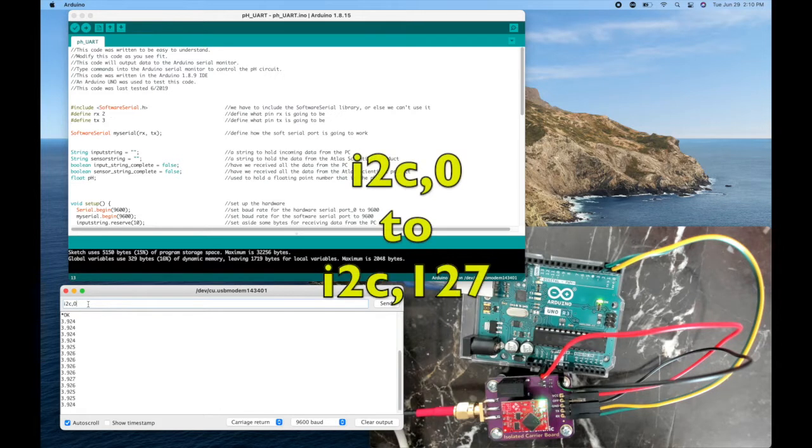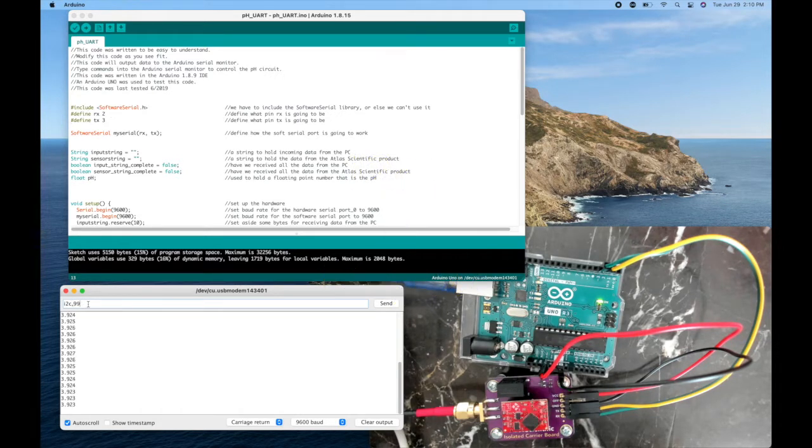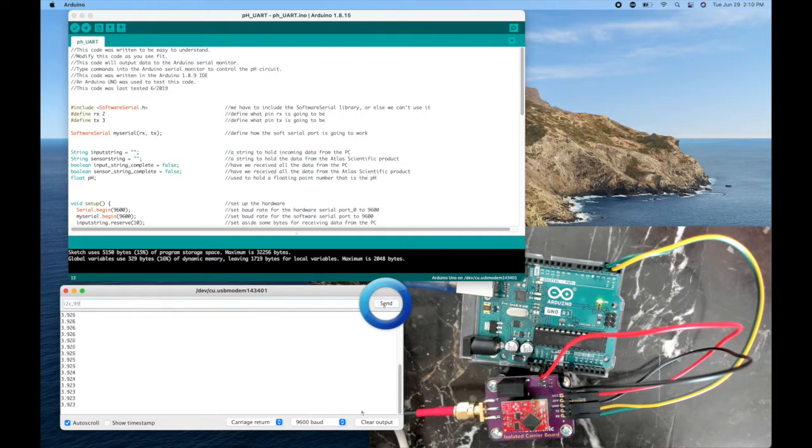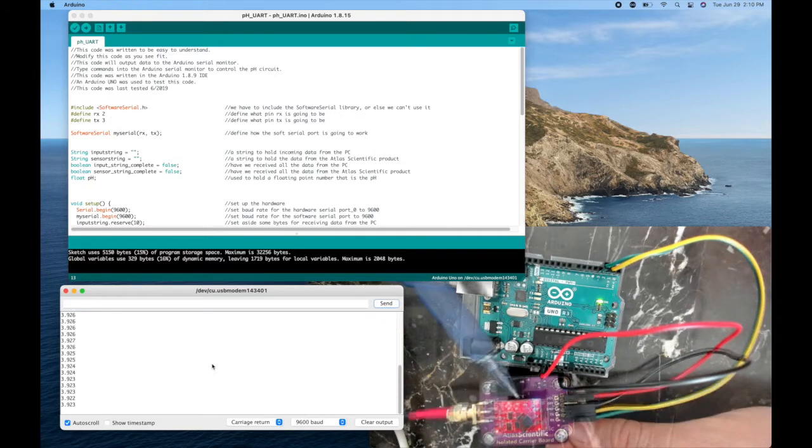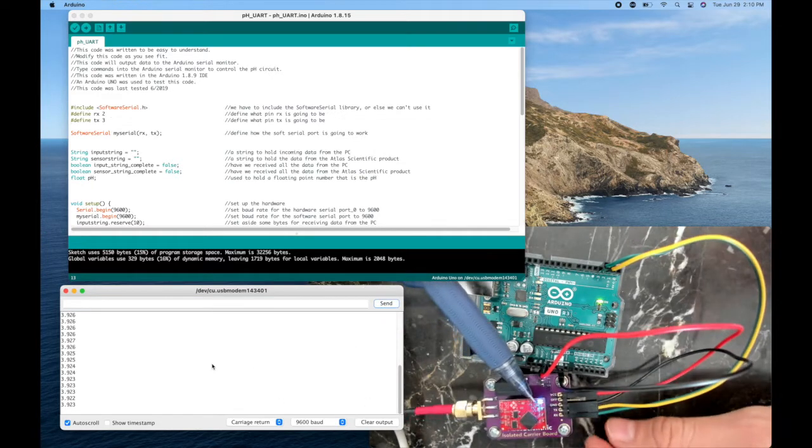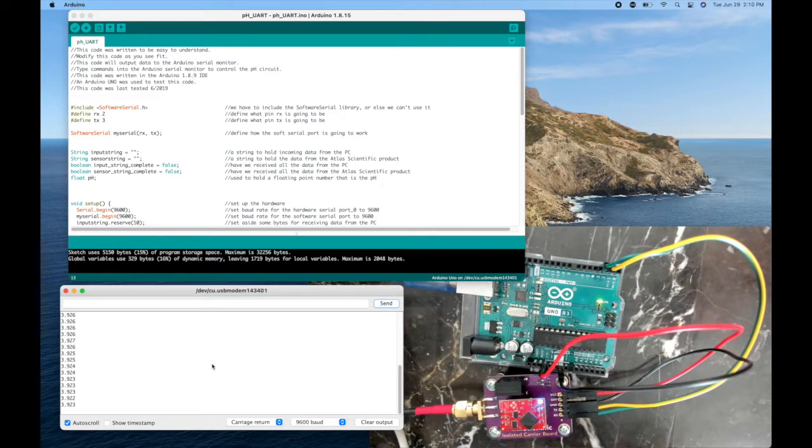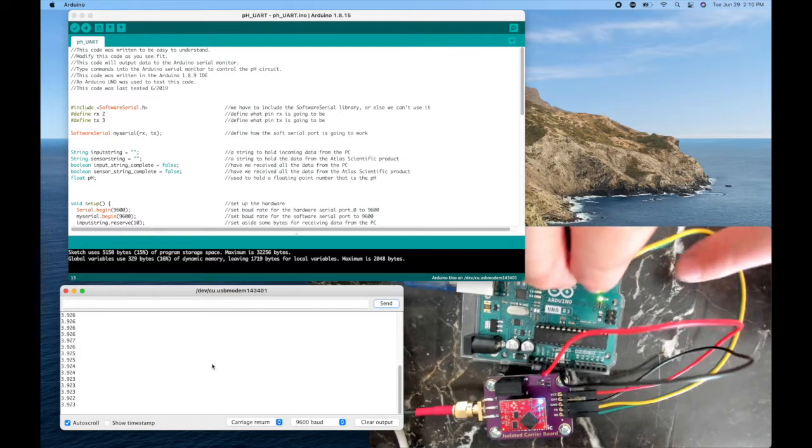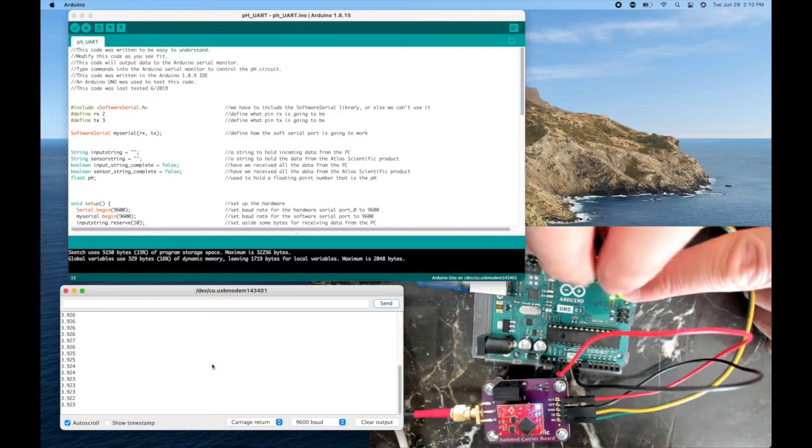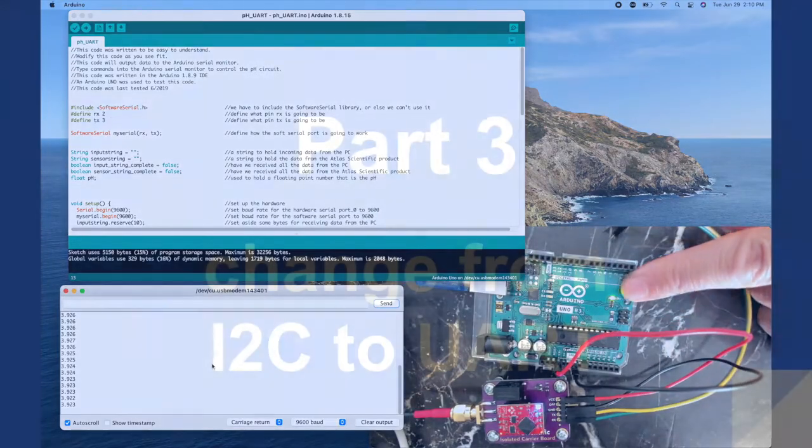You can choose anything from 0 to 127, but I'll go with the default of 99, send. We're in bright blue mode, I know that we're in I2C, so this wire combination won't work anymore.